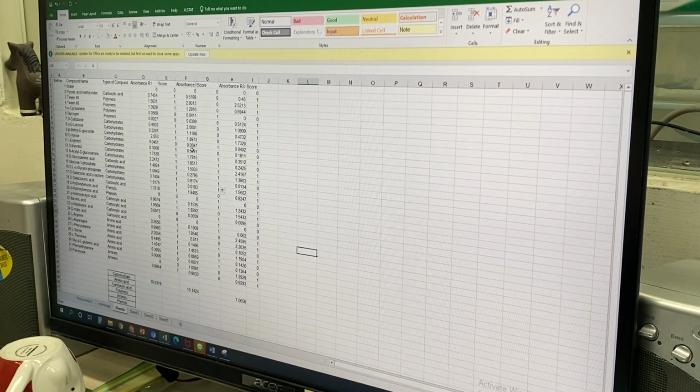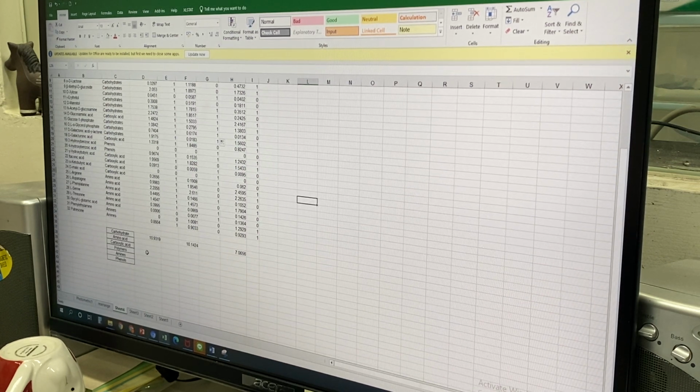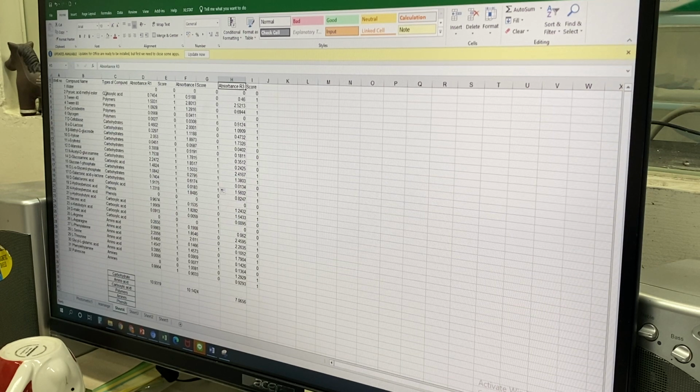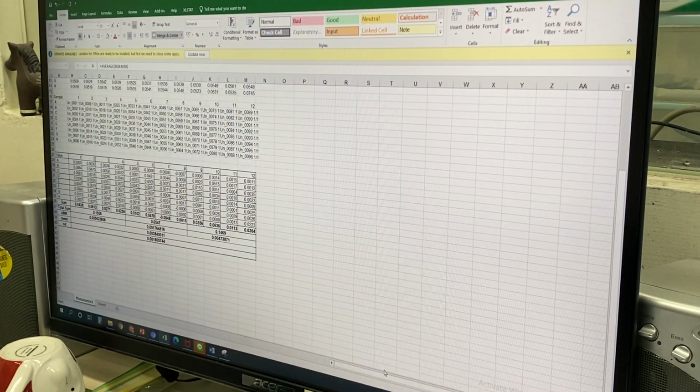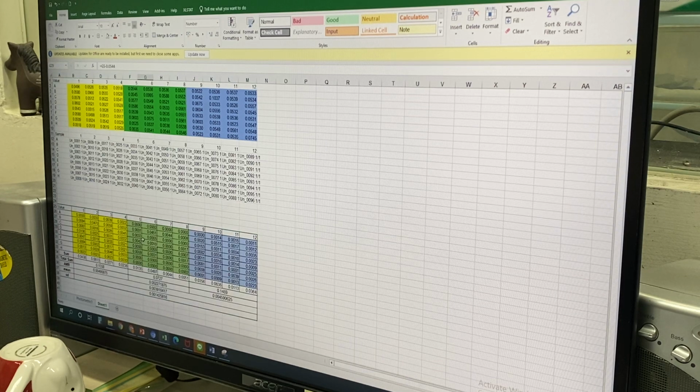So don't worry about my data. You just think about your data. If it is greater than 0.25, it will be 1, and if it is less than 0.25, it will be 0. So just forget about this data. I just gave you the example. So you can see the carbohydrate. This is your replica 1, replica 2, replica 3. Do you understand what I am talking about? Yes.